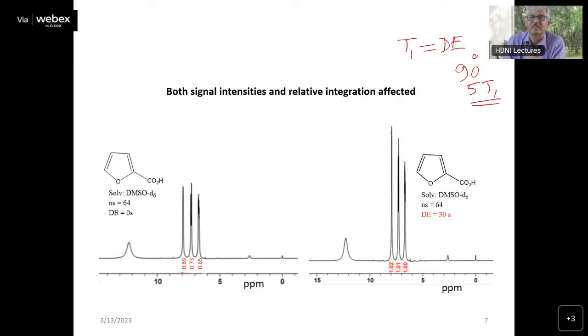Okay, so that is called the pulse repetition rate, and if you want to avoid that, you can use an optimized angle, that is called the Ernst angle, and I have told you how to do that.